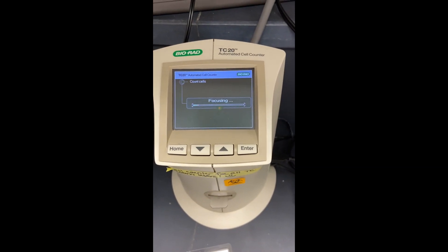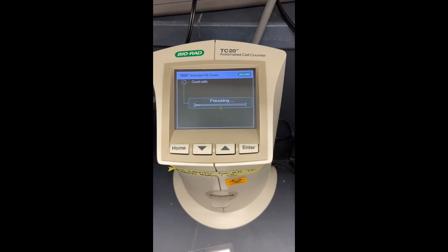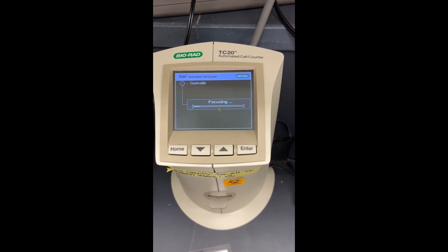And it automatically recognizes that there's trypan blue and cells there, and so it'll focus and count your cells for you.